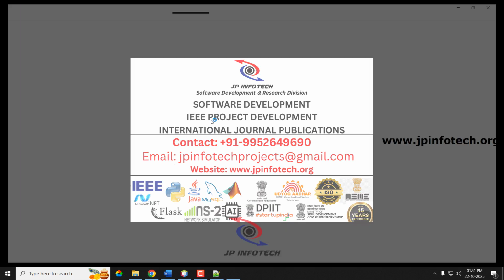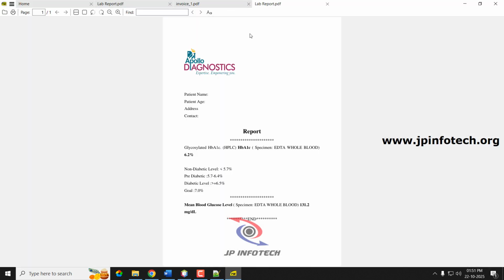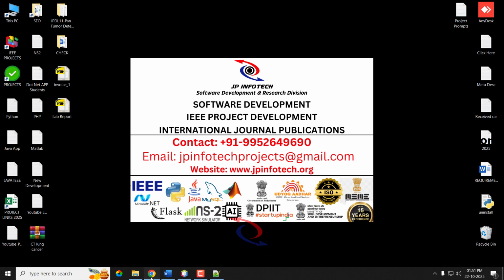I have just uploaded a sample report only, so you can upload whatever information they want according to the test. They can upload the values, or they can upload the scanned reports, X-rays, MRIs, whatever they want. This is a sample report only, whatever I have shown you now.